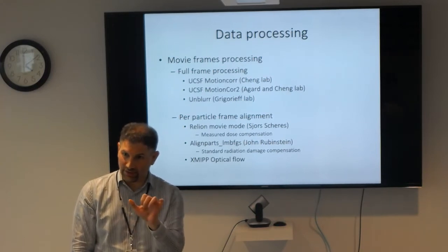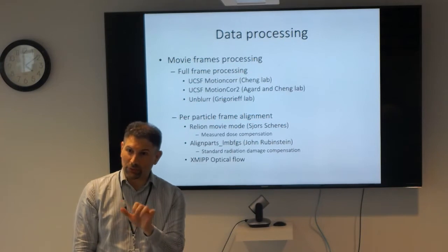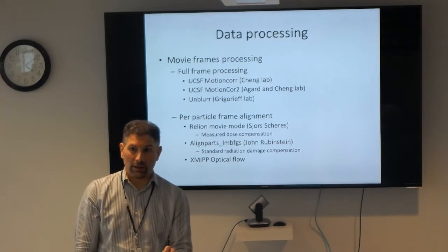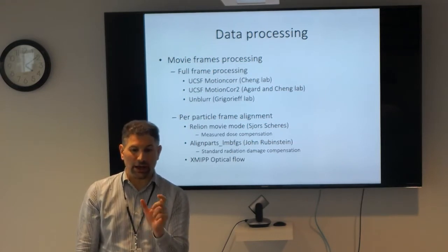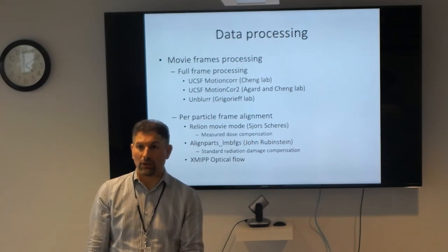You're looking at the statistics, essentially the alignment and the translation and rotation accuracy. How is Relion telling you to throw it away? Because generally, I do it visually. Going by these numbers, sometimes you get great numbers and you look at the class average, and the class average is just gibberish, right? So I always go visually.